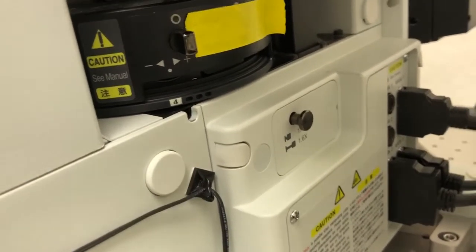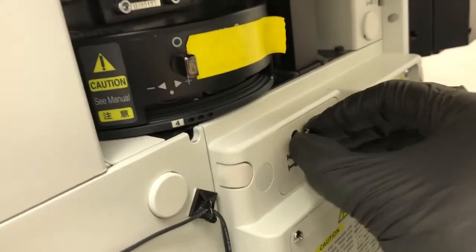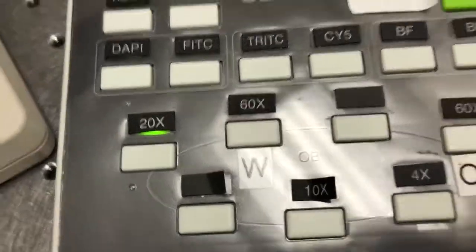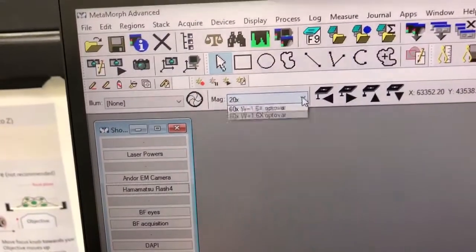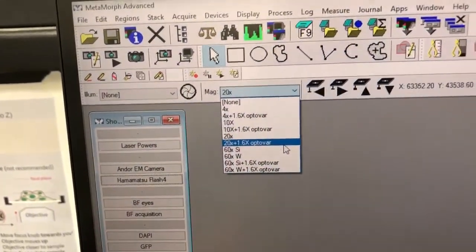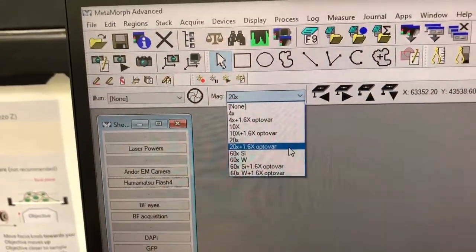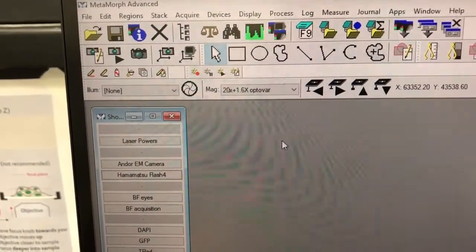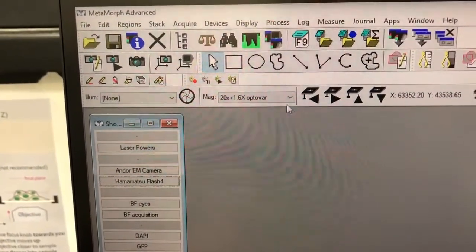But if you do pull it out, let's say we leave it there, and if you can look here, we're on the 20x objective. To have proper pixel scaling once we save the data, we need to go to 20x and say, actually, we have the 20x and the 1.6x optovar.